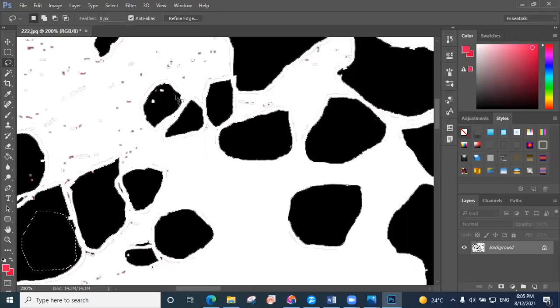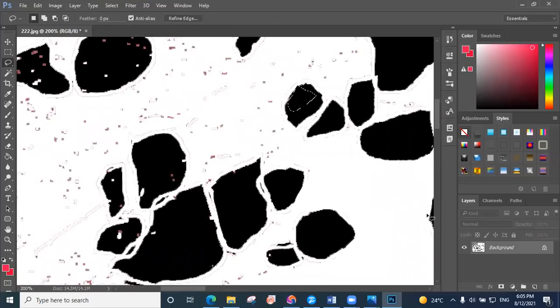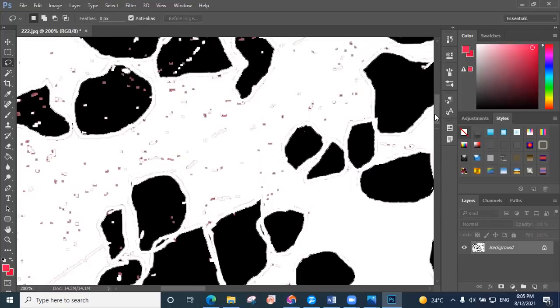This depends on you, whether you start to clear the white dots on the grains, or you want to clean all the dots in the other places in the space of the structure. This depends on you, or you can do both one by one together. You need to be patient.